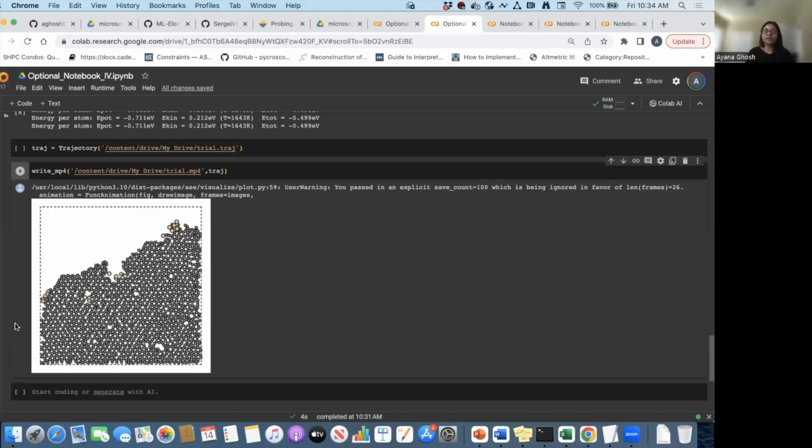One more thing. Recently, as I've mentioned, I was working with MoS2 data. When you look at a plane, the sulfur atoms might be in the other plane, so you're probably not detecting those. So when you're using that MoS2 image to create your simulation object, it's not the right representation of the material itself. You have to make sure that you're identifying all the atoms correctly, even in the different plane. If not, then you have to add in the atoms to make sure your coordination is satisfied. Otherwise you'll just have something like a hexagon with Mo and S2 in the same plane, which is not the right representation of your atomic structure.